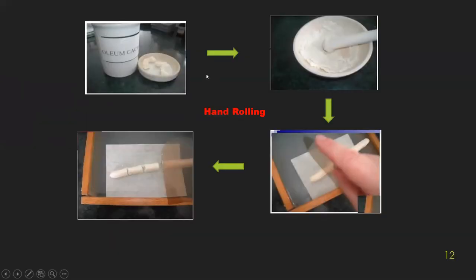For hand rolling, you triturate the mixture in a mortar, then roll it with your hands to form a cylindrical structure, and then cut it into segments to form the individual suppositories.